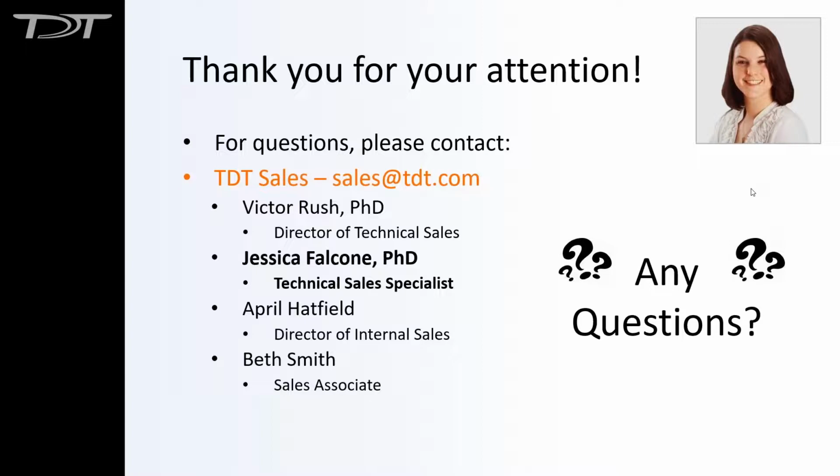Okay. I do not have a specific answer for this. We are doing some tests. I need to see if that data has been made available. But I do believe from the Doric and Thor labs, they suggest, I think I remember seeing a chart where the autofluorescence returned about a week or so after initial photo bleaching. Again, like I said, we're going to take a look and confirm those numbers as well. But I would say within a week or so, the baseline autofluorescence does start to return.